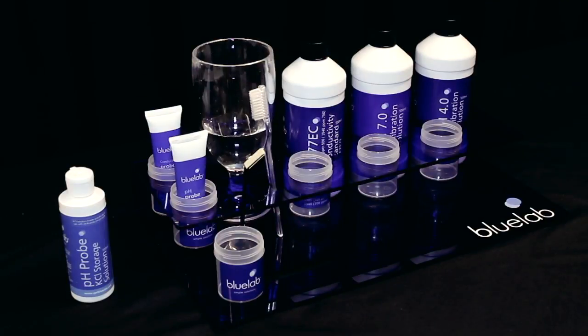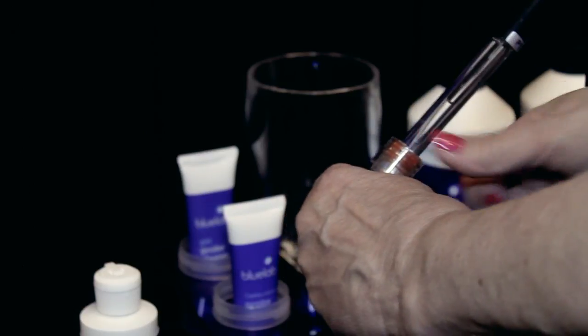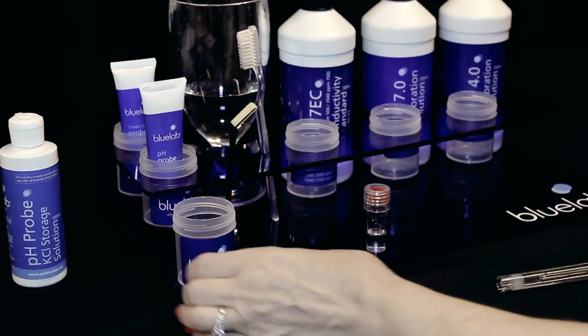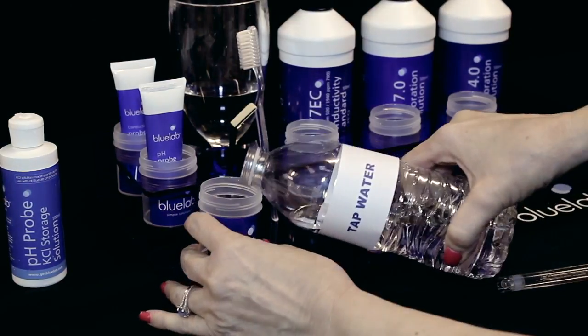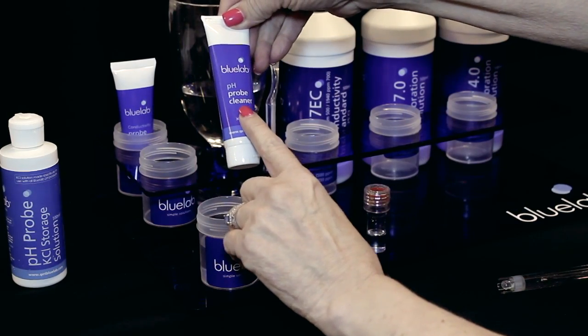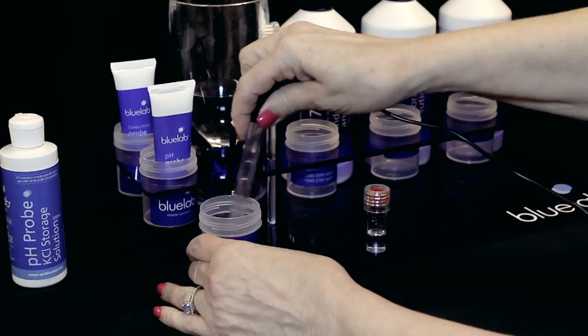We'll start with cleaning the pH probe. Remove the storage cap, grip the base and twist the top one rotation clockwise to loosen a little. Slide the cap off and place it upright. Fill a plastic cup with clean tap water and add a few drops of Bluelab pH probe cleaner. Gently stir the probe in the mixture.